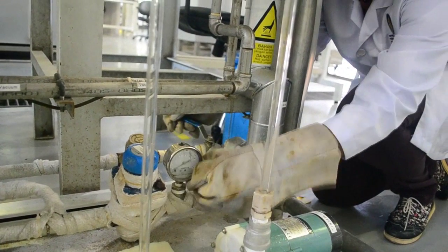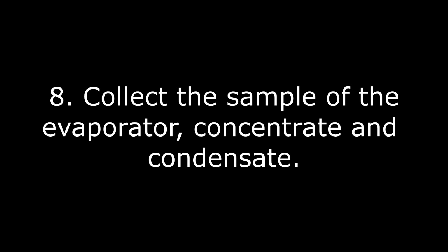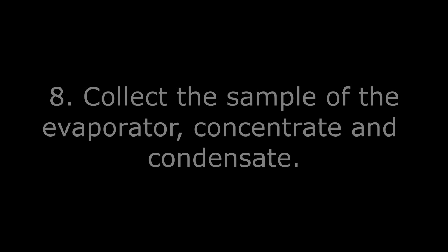Record the time when the solution has boiled, which means when there is formation of many bubbles. After 20 minutes, close the steam supply valve and open the steam purge valve at the same time. Collect the samples of the evaporator, concentrate and condensate.